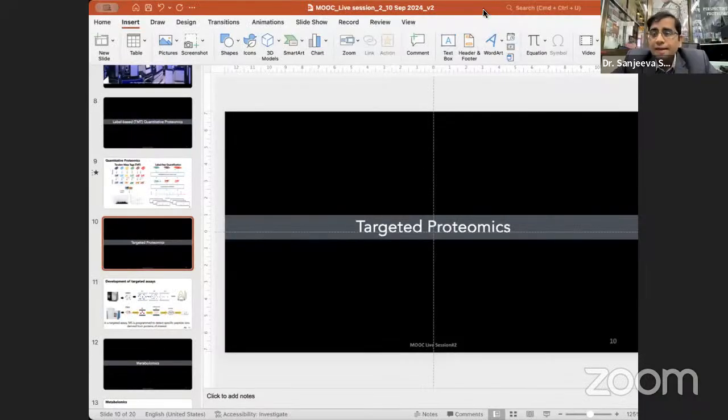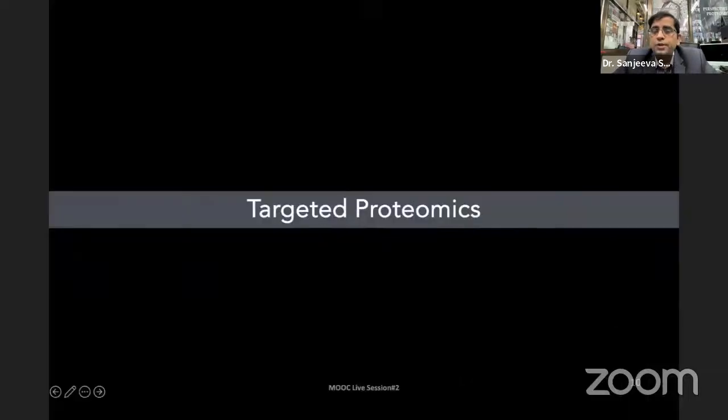All right, thank you, Arghya. This is one of the workflows of doing quantitative proteomics. Once you have identified a lot of proteins, which show you significant protein levels and are a good hit for you, you need to validate them, right?